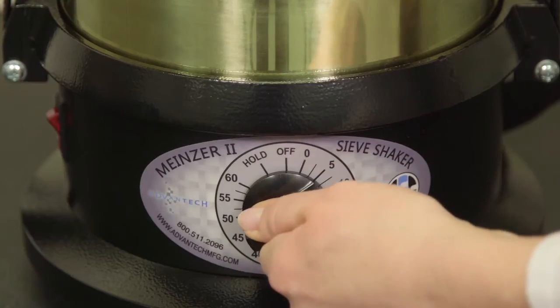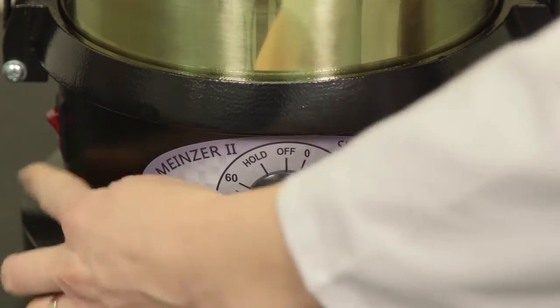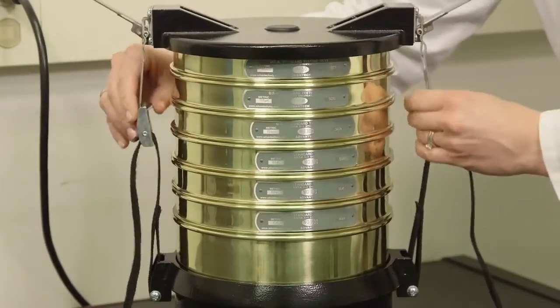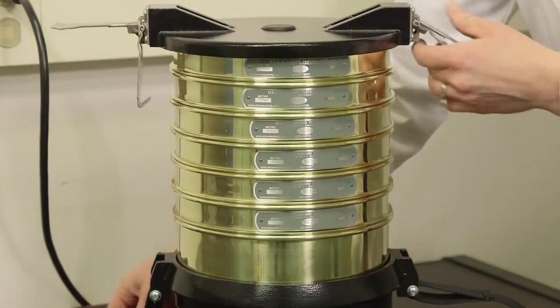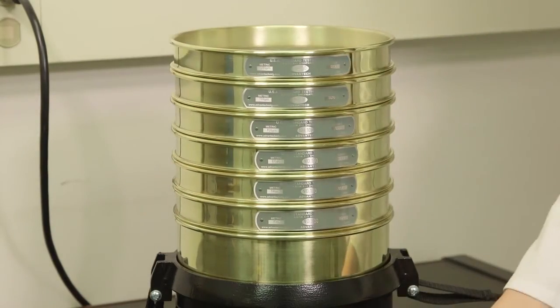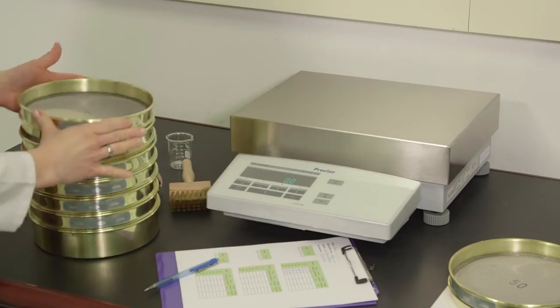Set the timer to the desired interval. Once the test run is complete, reverse the clamping procedures and carefully disassemble the stack and proceed to weigh up and calculate the retained fractions.